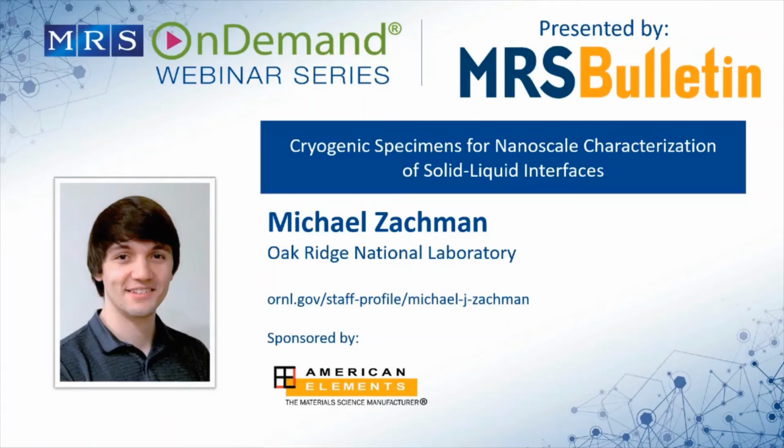But once you are there, we still need to make improvements in transfers between instruments and clean nitrogen to store in, because you can go through an entire day of preparing one of these samples, store it, get it to the microscope, and then find out that the 10 nanometer thing you're interested in has a 1 micron piece of ice on top of it, and you did everything right, but it's just too bad. So I think that's the biggest thing: you can just be unlucky still with contamination.